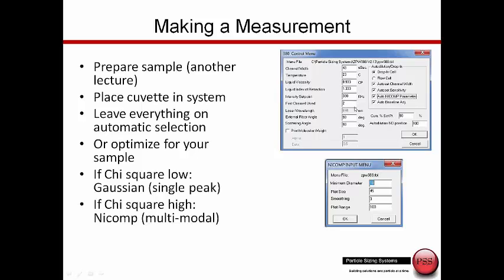Once we've configured the system for the measurement, we hit go, we hit one button, we take a measurement, and we look at the results.